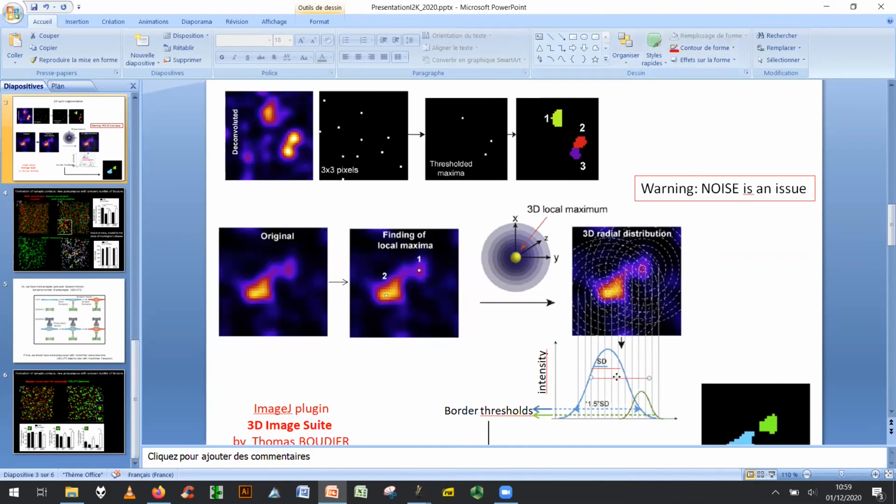And once I have this, I place it so it fits approximately here. Then I can read there a number in intensity, and this will be the threshold of the border of the object. Was that clear? So the larger the value, the larger the object will be.